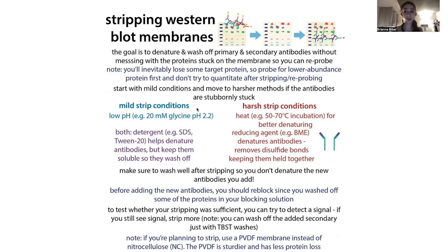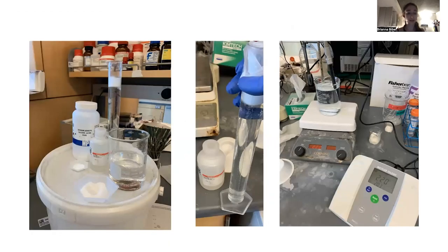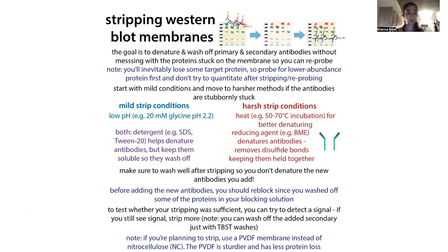For the mild strip conditions, we also help with denaturing those antibodies, getting them to loosen their grip and come off the membrane, by using a low pH. For example, the one I used had 20 millimolar glycine, pH 2.2. You adjust the pH with hydrochloric acid, and the low pH is going to help with that denaturing. Glycine, yes, that's an amino acid. It also acts as a good buffer when you want a low pH. So we use glycine in Tris-glycine gels and various other things.